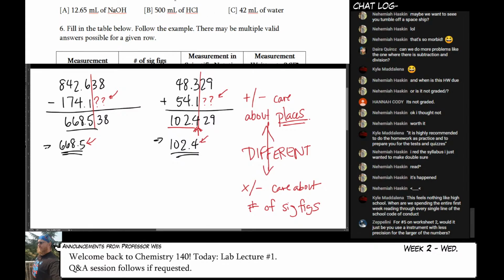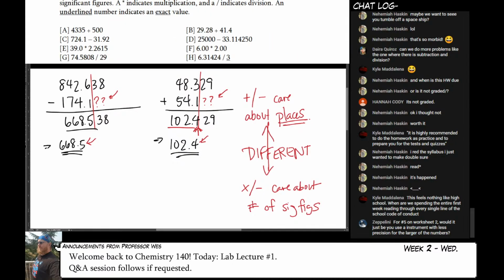But for 500, and that's actually something that's very common in the laboratory, you'd say, okay, go to the hood and pick up 100 milliliters of the solution, because you're going to just hold it in the beaker. Beakers are basically for holding stuff. You don't really measure with beakers. Graduated cylinders are good for crude measurements, and burettes and pipettes are good for fine measurements. But since we're not going to actually get to work in the laboratory, that's just my attempt to get you to see that in practice at least.